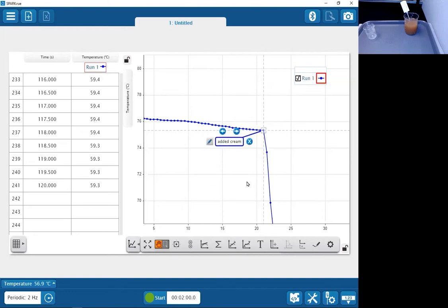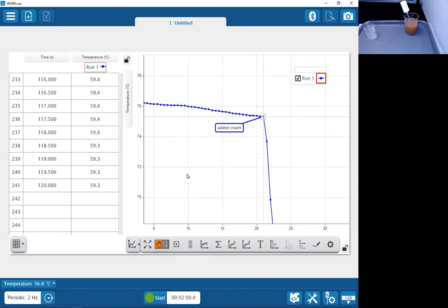So I've zoomed into that data using manual scaling and zooming on the graph Y and X axes, and I've added an annotation using the annotation tool. I'd like to zoom back out now and start to contemplate collecting a second run of data. The way to zoom back out immediately to see all your data is to use another graph tool. It's the leftmost and probably the most used tool in the graph toolbar. If I hover over it, you can see it's called Scale to Fit and shows 4 little arrows shooting off.